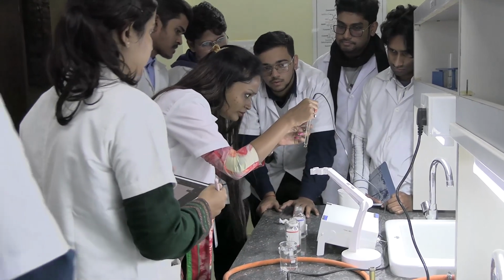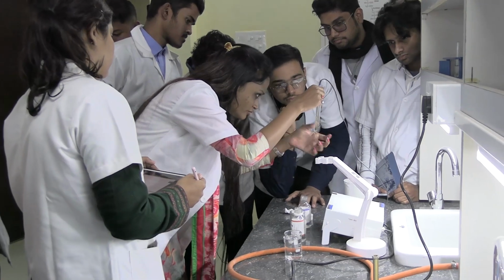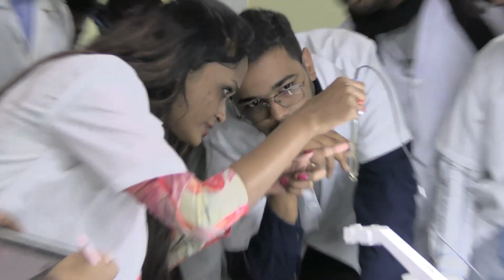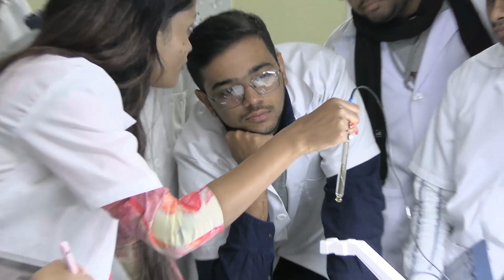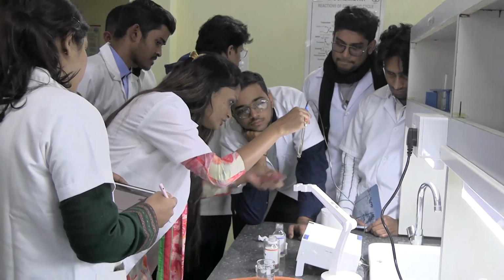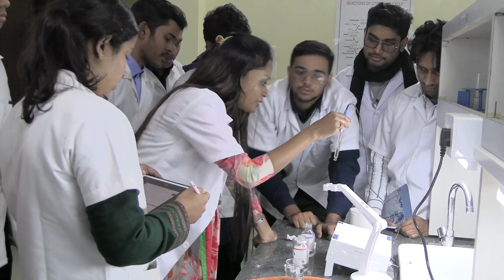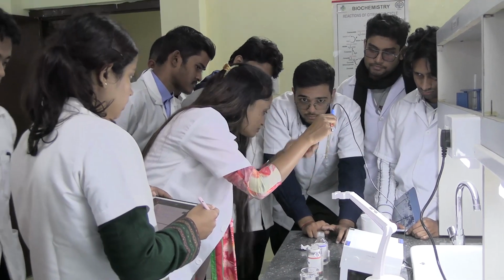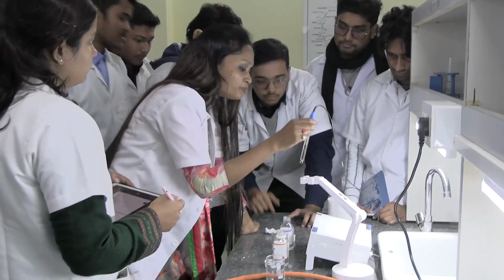The tip of the glass electrode contains silver chloride, and the tip of the calomel electrode contains mercurous chloride paste. The solution in the glass electrode is pH 7 KCl. So this is the electrode bulb.